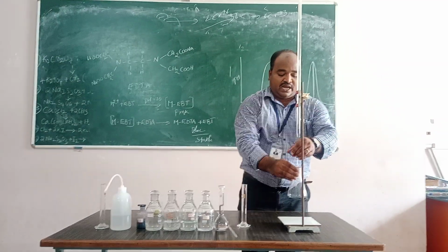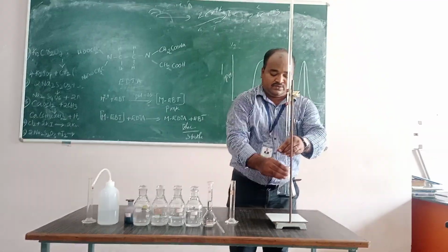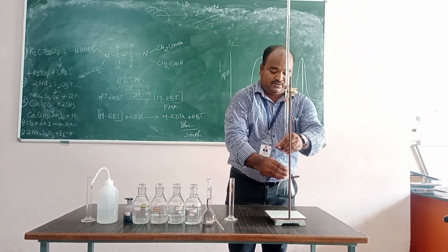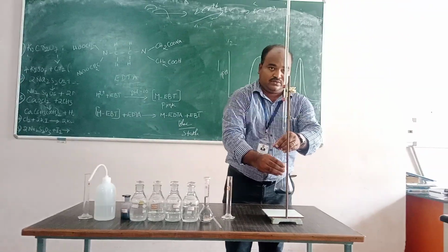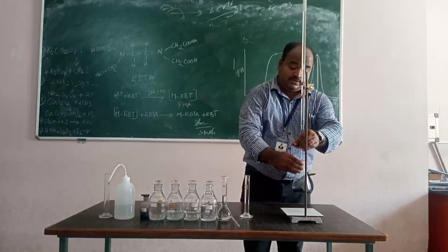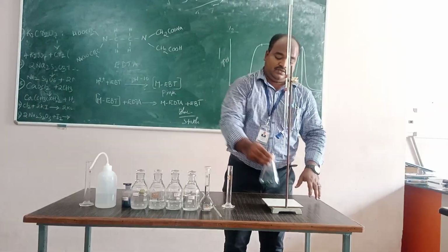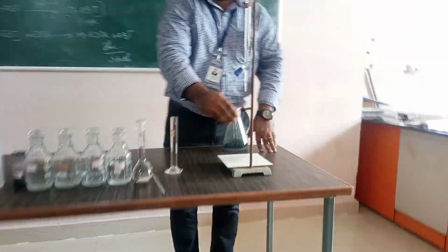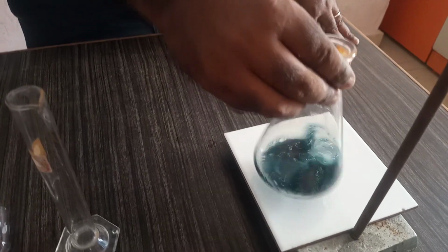So if I add another 3 to 4 drops, you can see a light blue or one type of green color.